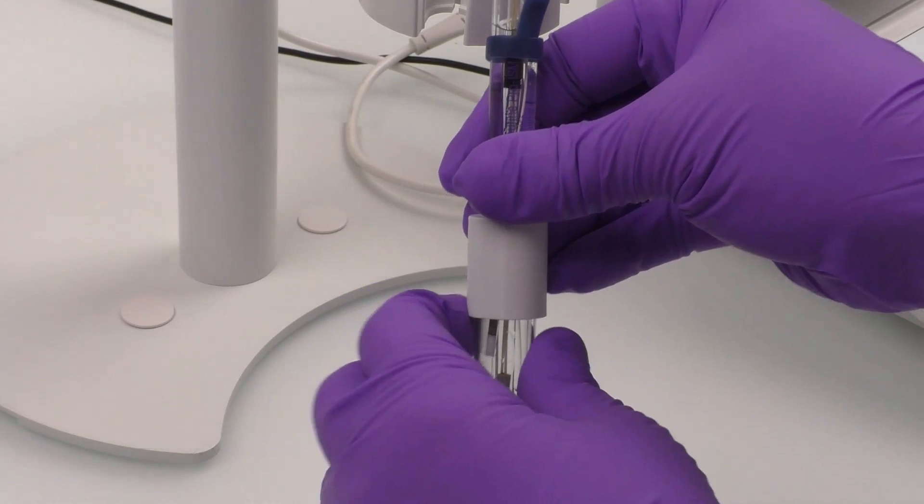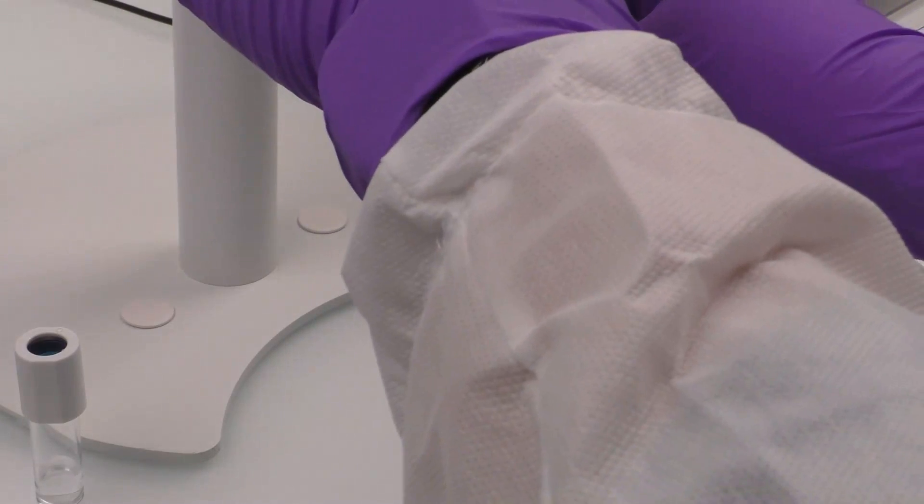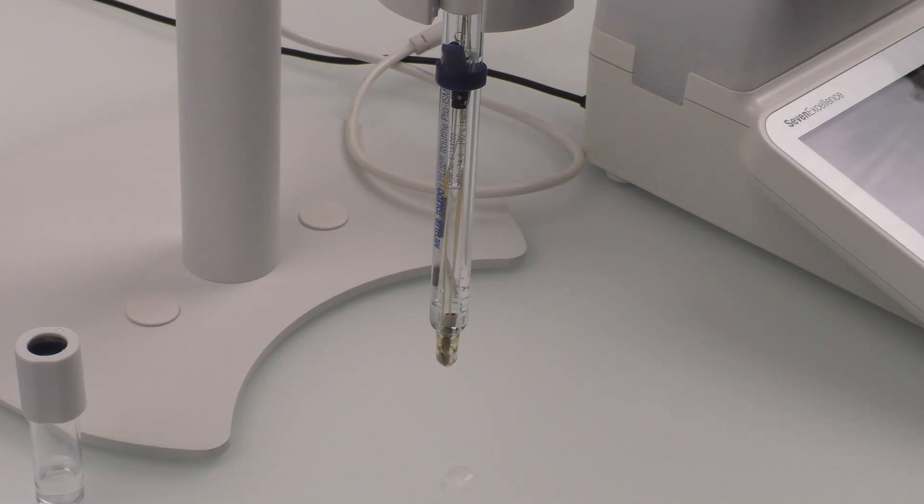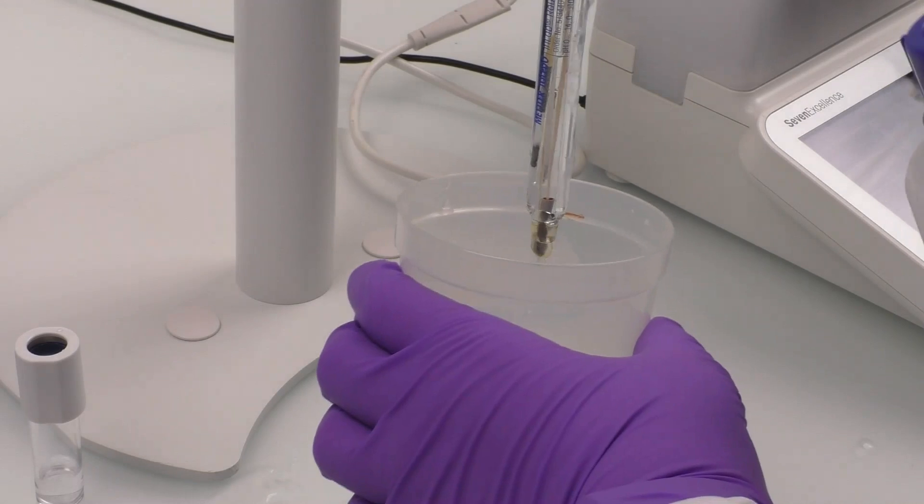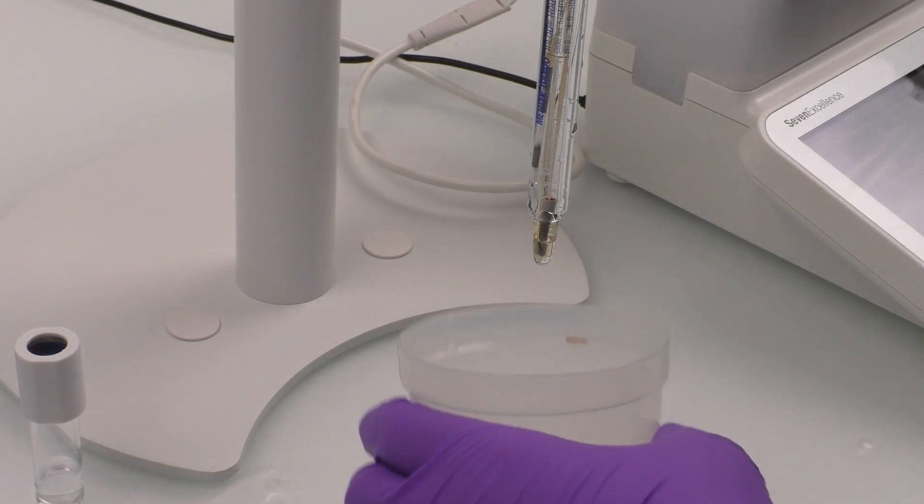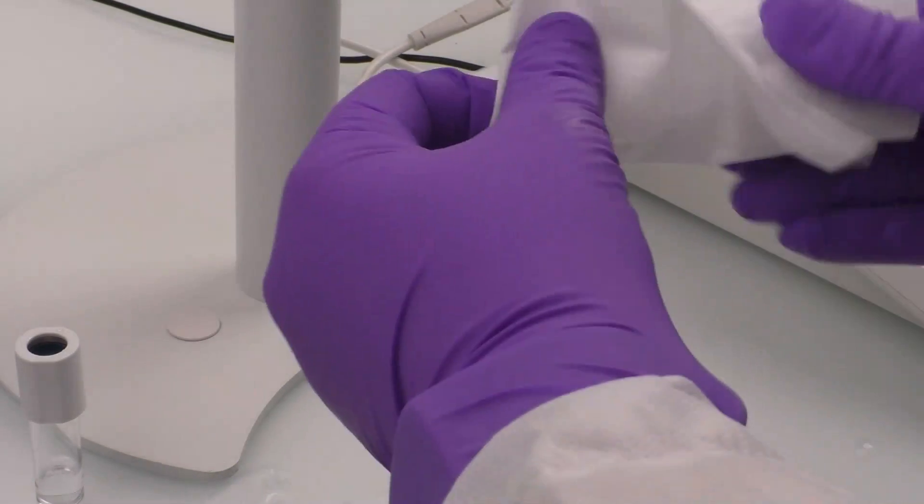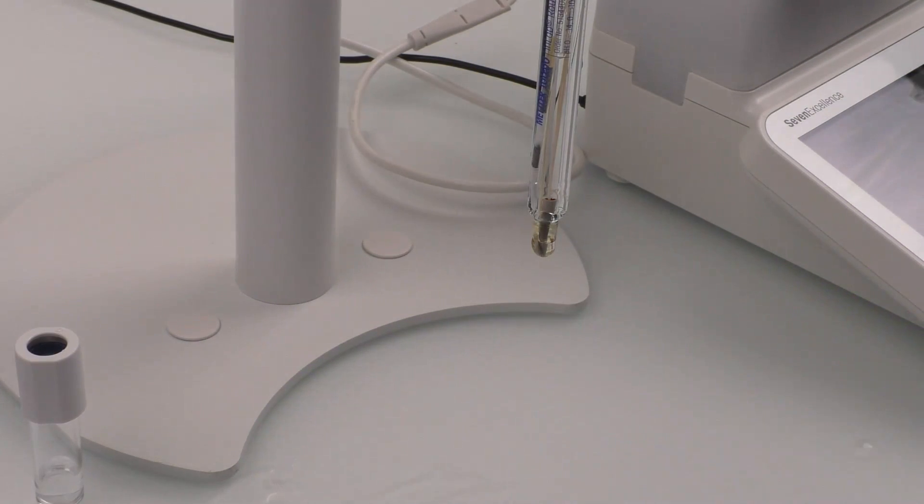Then, carefully remove the wetting cap and place it aside. Next, place a waste beaker under the sensor and rinse the sensor with deionized water, dabbing it dry with a tissue. Your sensor is now all set and ready for calibration.